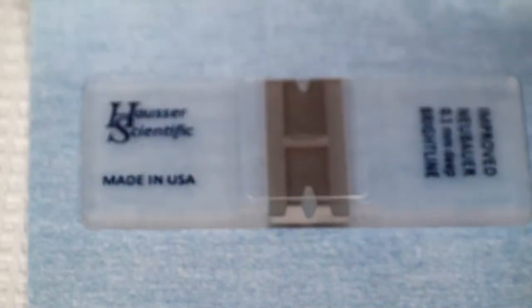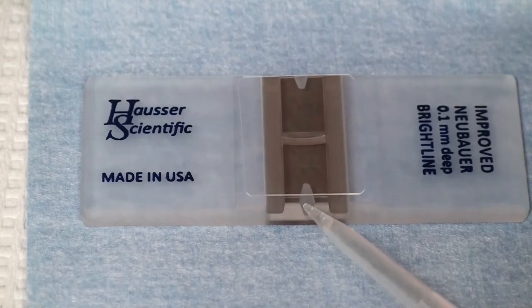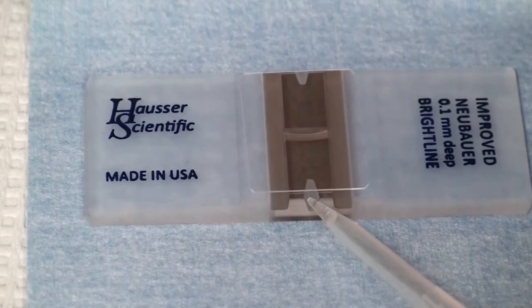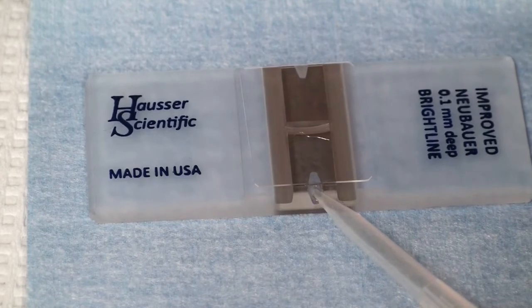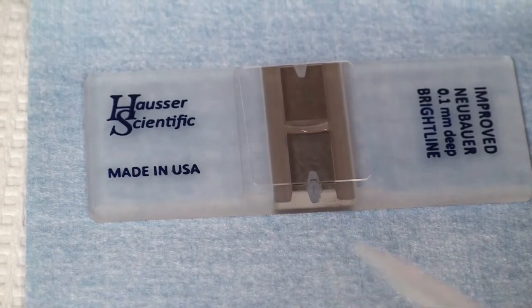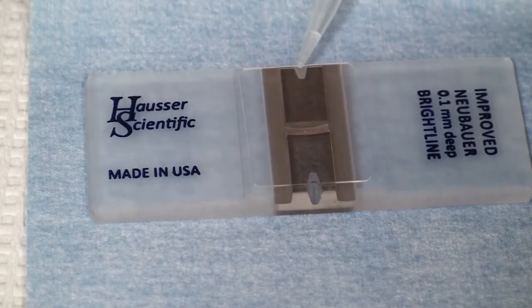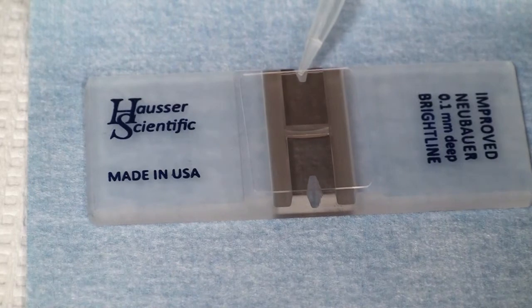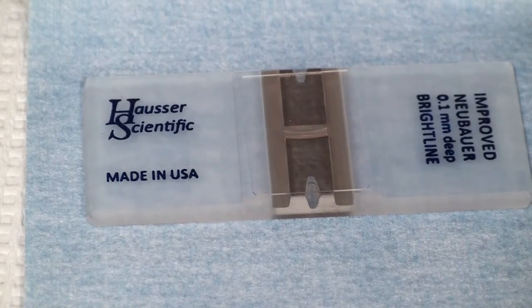The volume it takes is approximately 10 microliters. The coverslip sits 0.1 millimeters above the counting chamber, so when we do our calculations — if we count 1 square millimeter and divide that by 0.1 — we're going to have to multiply by 10,000 in order to get a concentration for 1 ml. We'll see that in the final solution.